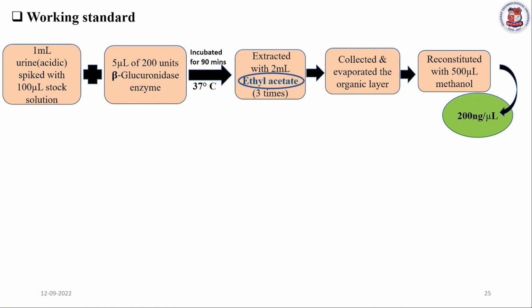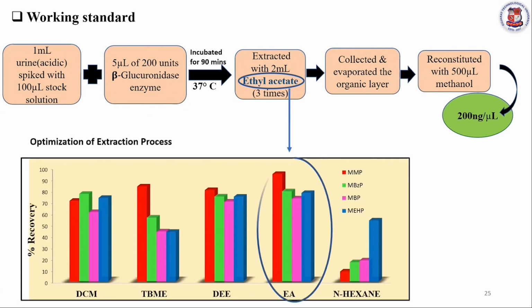Then for the extracting solvent, we selected different organic solvents for this study, like dichloromethane, TBME, diethyl ether, ethyl acetate, and hexane. At the end, we observed significantly better recovery with ethyl acetate than with the other extracting solvents.